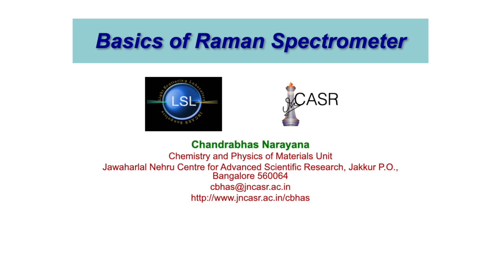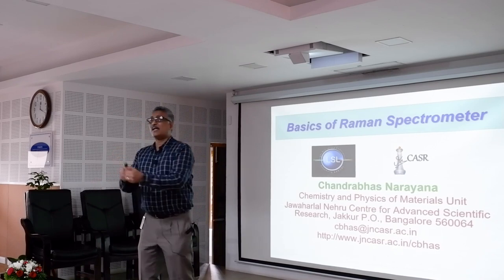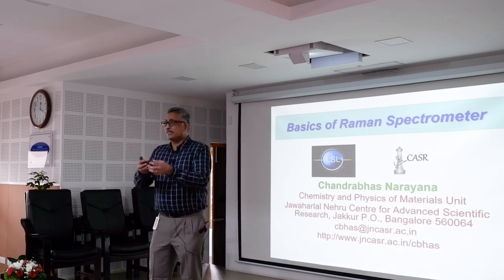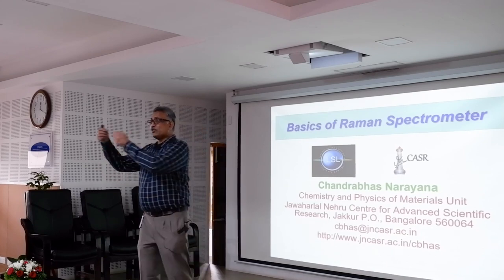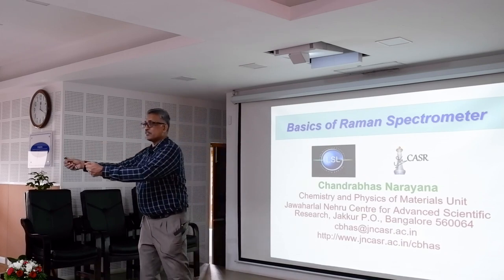I'll come to the Raman spectrometer. So I have given you an idea of many aspects of Raman and IR, and how this is related, how vibrations get coupled to the light, and how light is going to tell me which vibration it is. I can look at an atom assembly by computer program and find out what the different vibrations are and what their energy is. Then I do the Raman experiment, and I can say that this vibration is because of that.